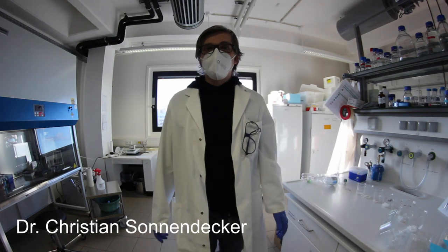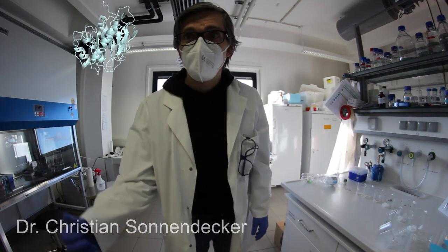Hello, we are here at Leipzig University. This is the lab we are working with the enzymes you got from the compost pile.